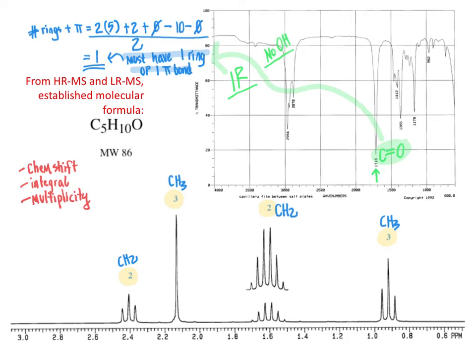So now that we have laid them out as predicting that we have 2 CH3 groups in the molecule and 2 CH2 groups in the molecule, we need to figure out how those are all stitched together and related to one another, and where they are in the compound relative to the carbonyl group that our IR supported. So we need to sketch out some possible ways that the atoms are connected to one another using the multiplicities that we have in our NMR spectrum.